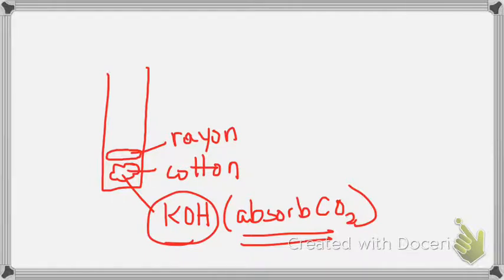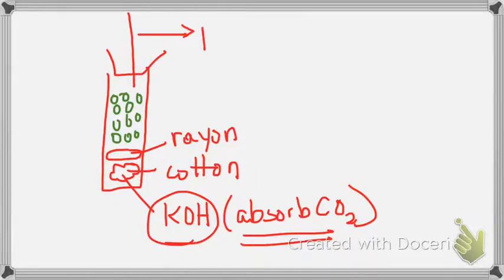All right, so then you're going to put whatever critters you're going to use in here. Let's say you're going to put peas in. I'll do that as the standard setup, and you can consider what you're going to put in. The setup was to put 15 germinating peas into the respirometer. Then you cap it off with a stopper that has a pipette on it, and this pipette is graduated.